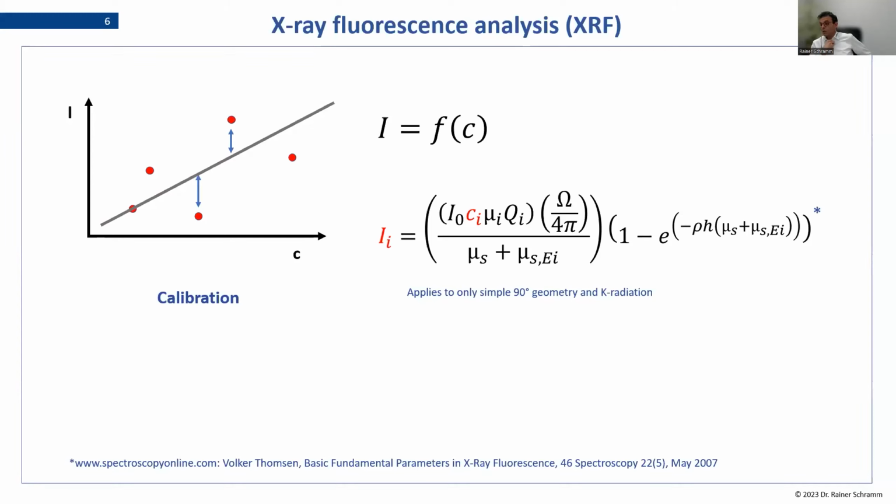And then also you will not get a 100% result. You will always analyze a part of your sample. And in this case, you have to check if you can normalize to 100%. Is this an option? For some samples like metals, this will be allowed, for others not. So there you also have to be very, very careful.